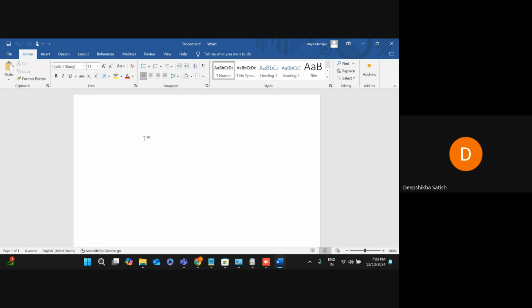So there are some important terms that you should know before running this reference based pipeline. So what is this biological analysis plan? Why do we need this? Because in order to check the gene expression, we need what? The biological analysis plan.